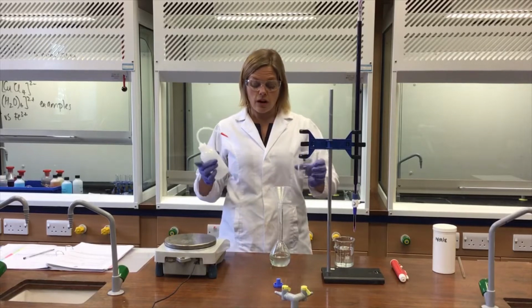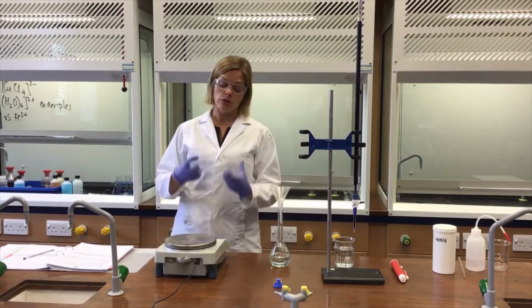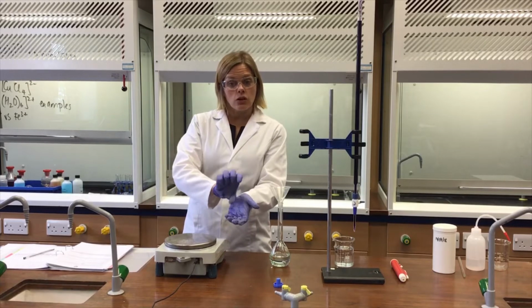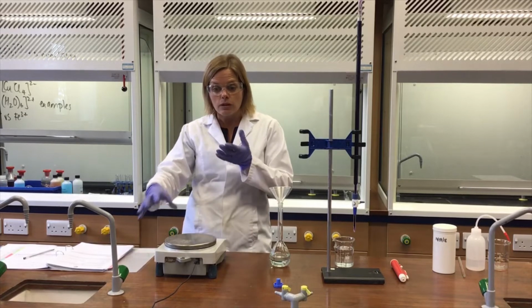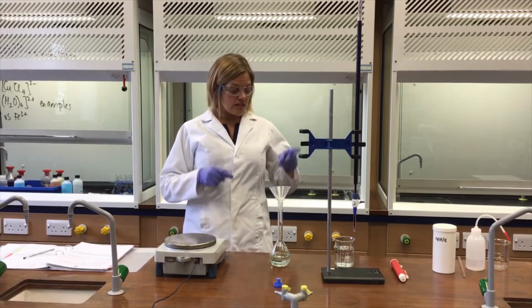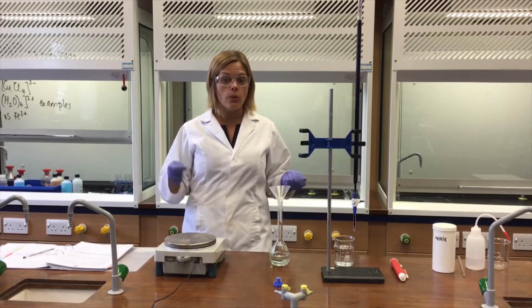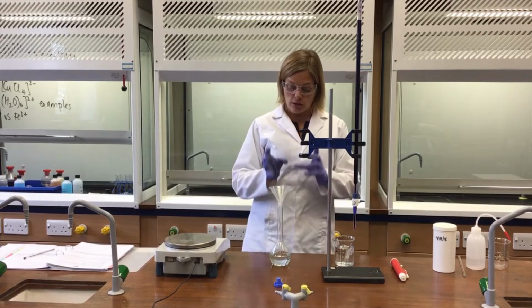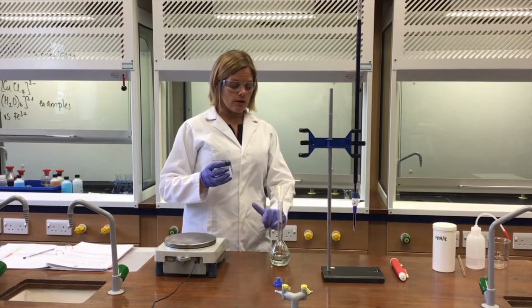So to summarise so far, first things first, weigh by difference. Weigh by difference was where I took the weighing boat, added the solid, recorded the total mass, transferred the solid, took the weighing boat with the residue and took the mass of that. And then the difference is the exact mass of that solid that's been transferred, so that's weighing by difference. Then dissolve the solid completely, so add distilled water, stir well until all of the solid has dissolved. Transfer that solution with washings, with rinsings, into the volumetric flask. And finally, make up that solution to the graduation mark.